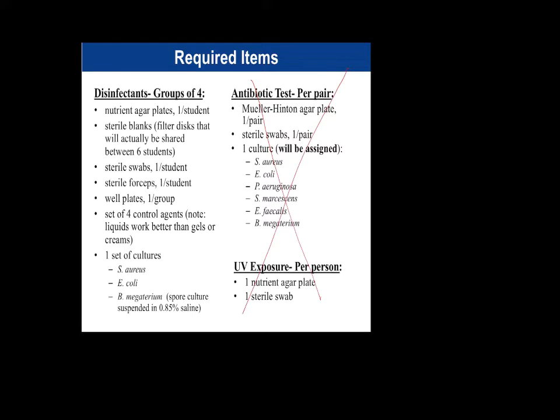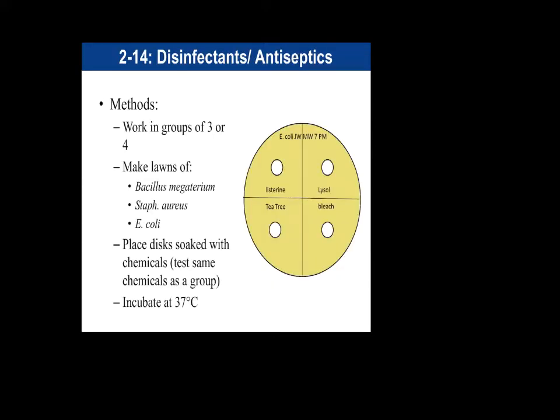We will worry about the antibiotic plate in a future lecture, so don't worry about that now.